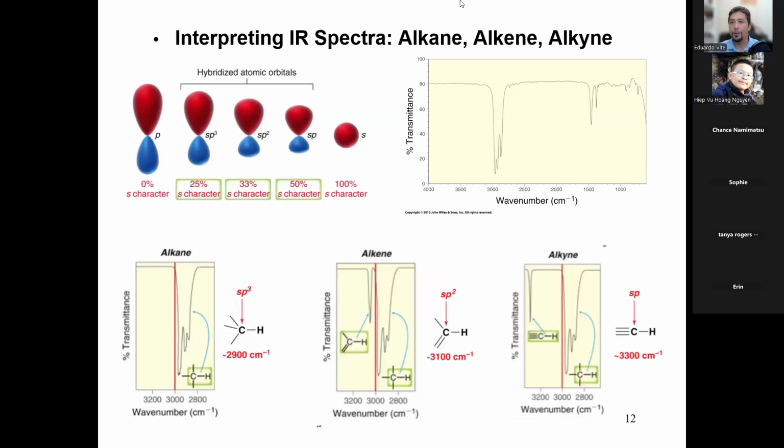All right, so let's start with zero functional groups. Just a plain old boring carbon chain. Nothing else. Well, since there's no functional groups, there are no vibrations of anything except what? What is the only bond that is vibrating? If all you have is an alkane, what is the only type of bond you have? I think somebody said it in the chat. CH, exactly. CH bond. Everybody agree?